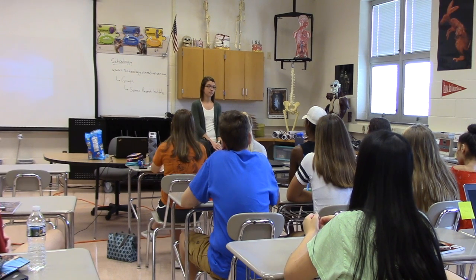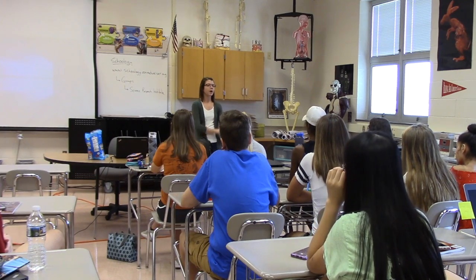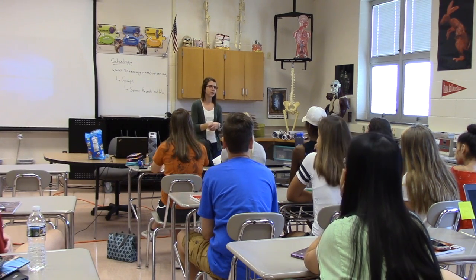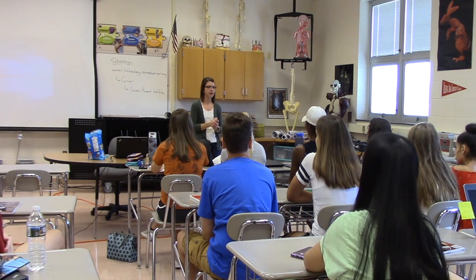We do the sterile glove. Okay, you don't wear the sleeves that come up over your lab coat sleeves? Okay, so we have that extra protection there of the sterile sleeves, and then we wear the sterile gloves. Do you guys spray your hands down with IPA or anything like that? Alcohol? Ethanol? Okay, yeah, so that technique's actually what we use in industry as well, except we use isopropyl alcohol.